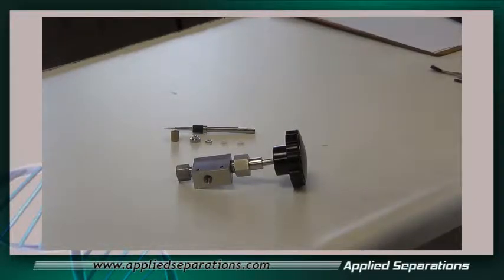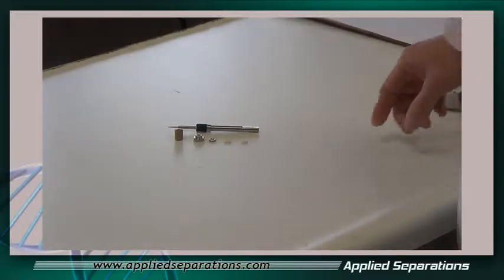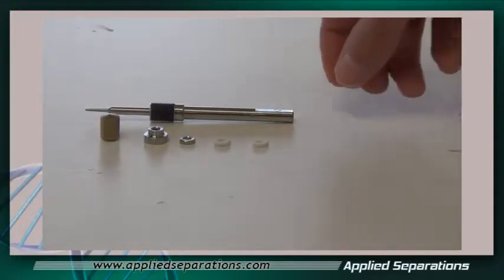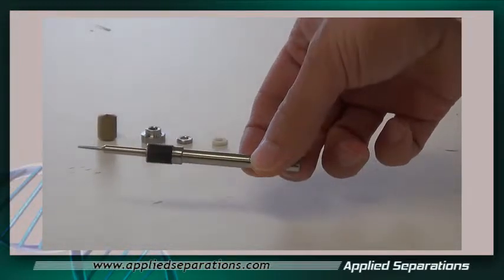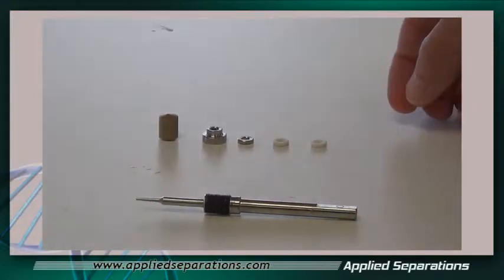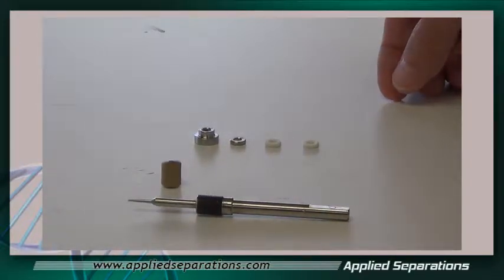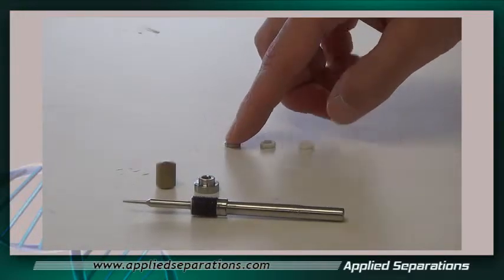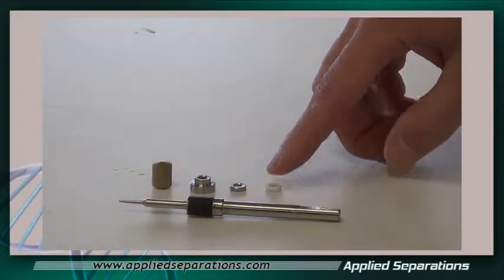Right now I'm going to show you how to install a rebuild kit for a micrometering valve assembly. Inside the kit we have six components: the replacement stem, a brass seat, a large stainless steel washer, a small stainless steel washer, and two small Teflon washers.